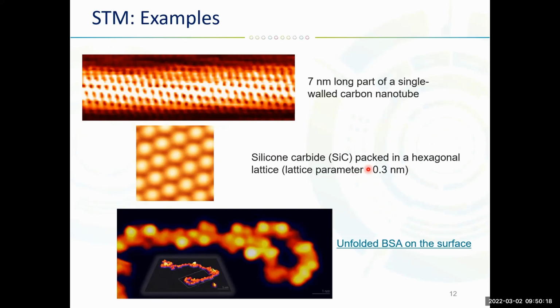But one of the key questions for all these studies of biomolecular dynamics is whether they are influenced by attachment forces or linkers. Because usually if you want to study the folding of the protein, you attach it by one of the ends, either the C-terminal domain or N-terminal domain, to the surface. So don't forget about how long the linker is, and whether it can influence the protein folding, because if it's too short, then the folding can be affected by the surface to which the protein was attached.